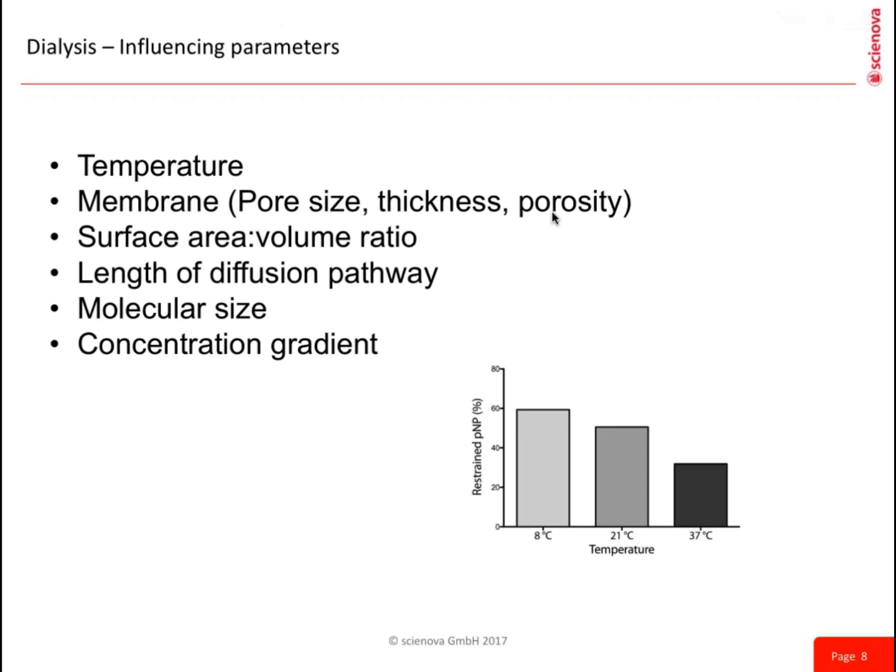If you want to accelerate the dialysis, you should have a high surface area to volume ratio and short diffusion distances.